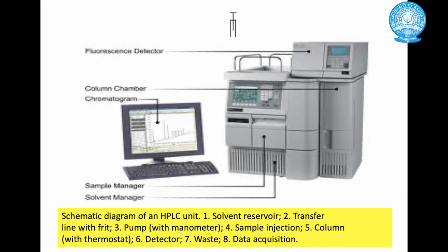The compounds are getting separated depending upon their interaction with the packing material, which is the stationary phase present in the column. So a few compounds will interact for a longer period of time, and other compounds will interact for less period of time.